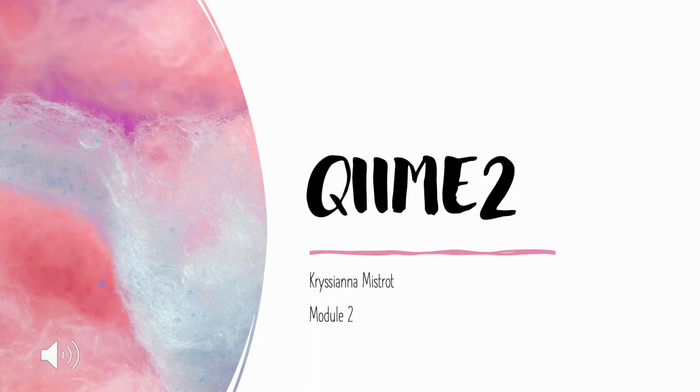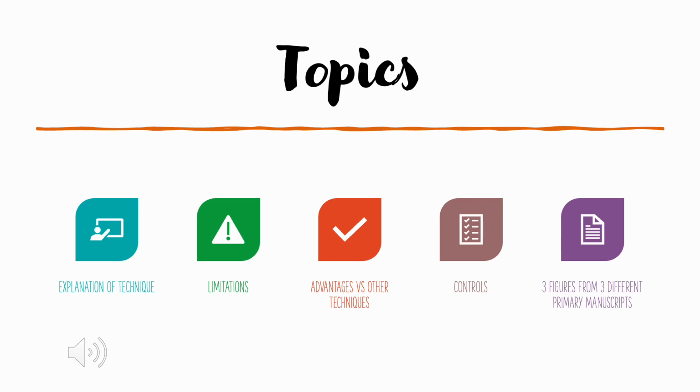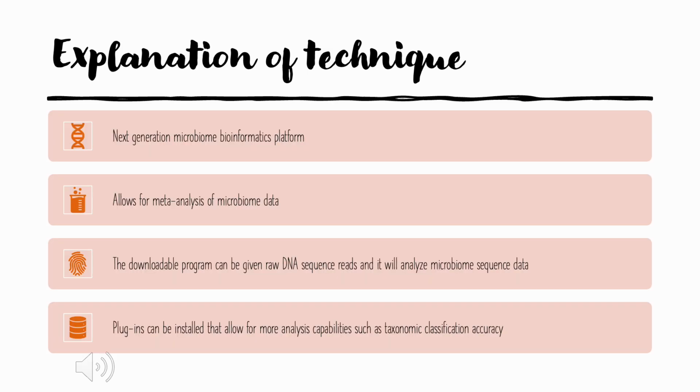Hi, my name's Kryssianna, and I'm going to go ahead and talk to you all about QIIME2 today. And here are the topics that we're going to discuss: an explanation, limitations, advantages, controls, and then we're going to look at some figures.